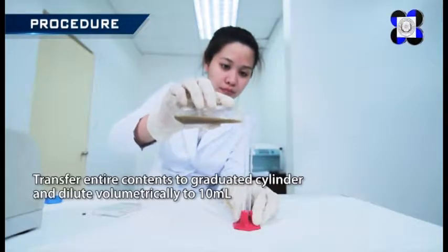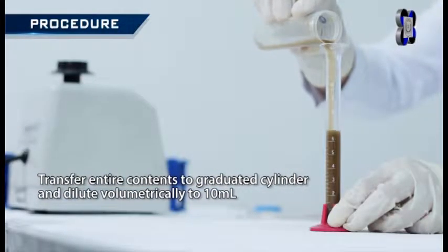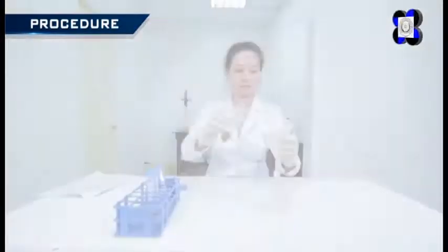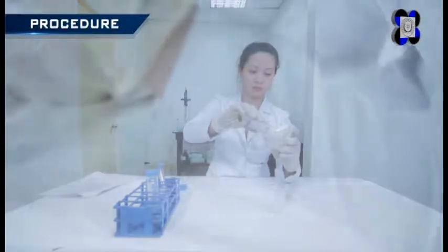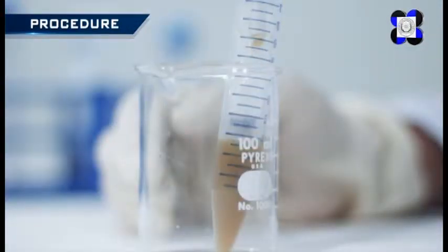Transfer entire contents to graduated cylinders and dilute volumetrically to 10 milliliters. Gently stir contents to homogeneity and allow to settle until a portion of the supernatant is translucent and can be decanted free of solid particles.